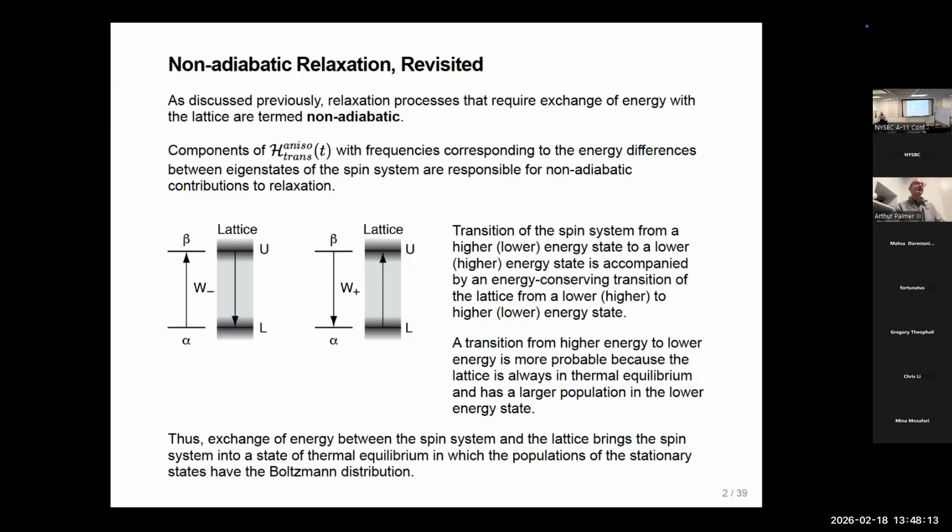Or in a solution probe, there are coils that are designed so that the E field is roughly orthogonal to the B field, and then you don't use a round NMR tube, you use a tube that's flat, so that the narrow dimension is feeling the E field, and the long dimension is feeling the B field. So there's less water for the E field to heat up.